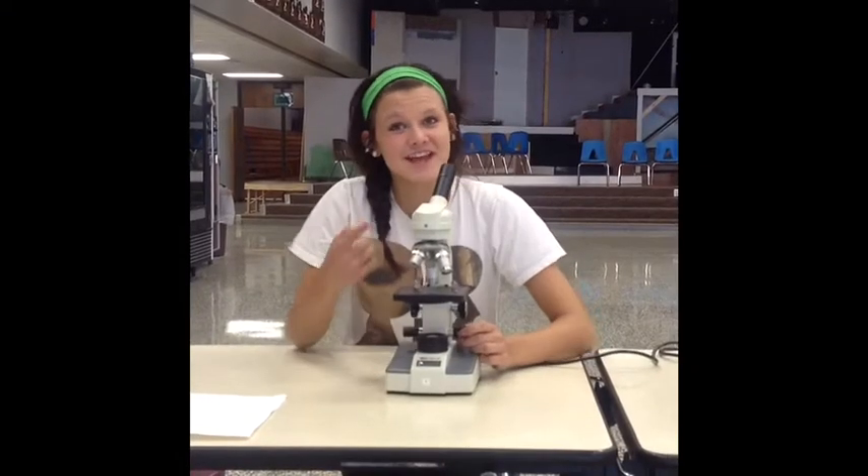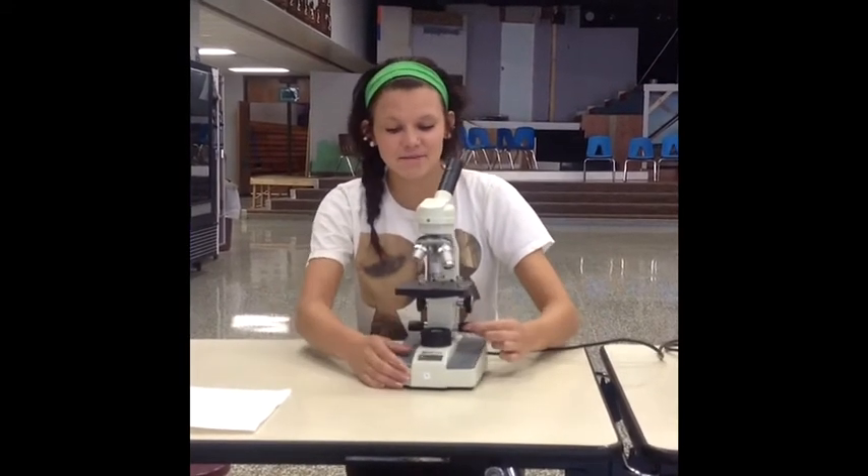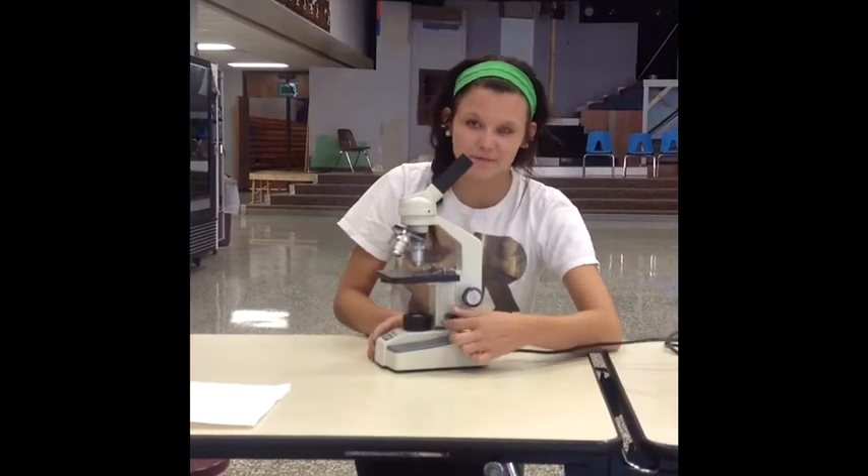Now when you look into the eyepiece, you may not see much of anything. This is a simple fix, ladies and gentlemen, easily done by turning your fine adjustment knobs towards the bottom.